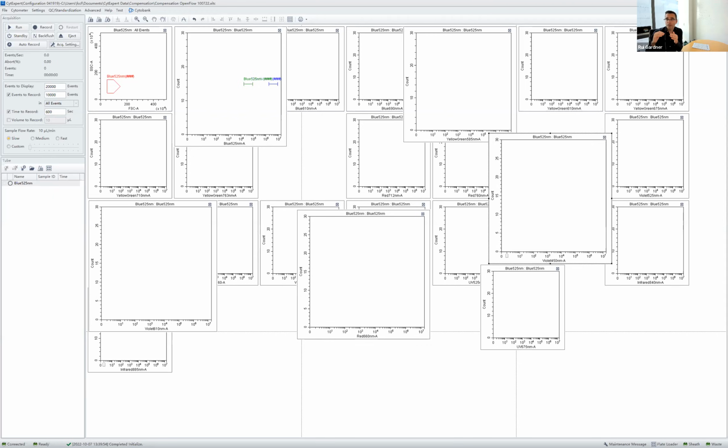That you basically don't need to use the same gains for each single stain control. You can use different gains and it will recalculate the offset of those gains, and so everything will match at the end, right? Assuming perfect linearity, yes.